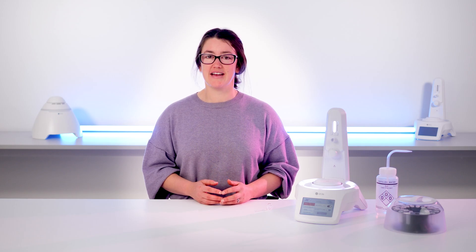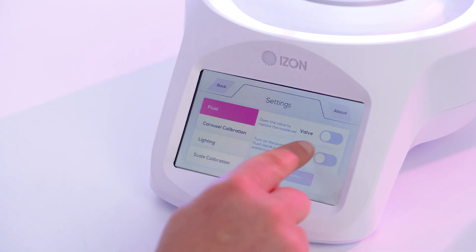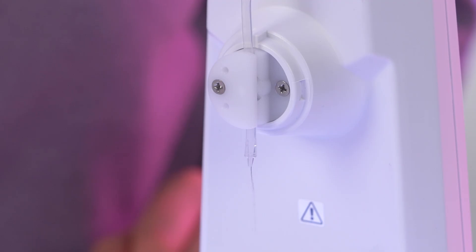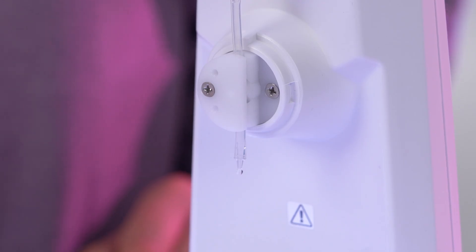In the AFC, there is a valve which can be accessed through the settings menu. This valve serves the crucial function of regulating the flow of fluid. When in the open position, the fluid is allowed to flow freely. When the valve is closed, it exerts pressure on the silicon tubing, pausing the flow. So we need to fit the nozzle set properly to enable the valve to do its job.